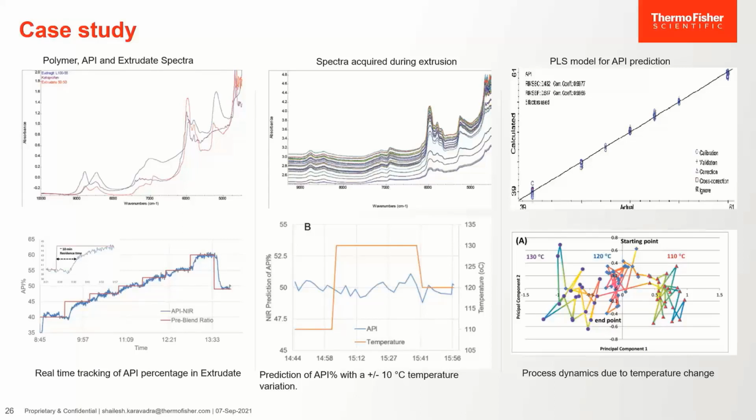Since the PCA method relies solely on accumulation of multiple batches of good process spectral data to define the steady state, it does not require a calibration model. It is independent of the product formulation, and it's easy to implement. Finally, because NIR is non-destructive and so fast, NIR-based quality monitoring methodology can be easily transferred from process development to manufacturing.